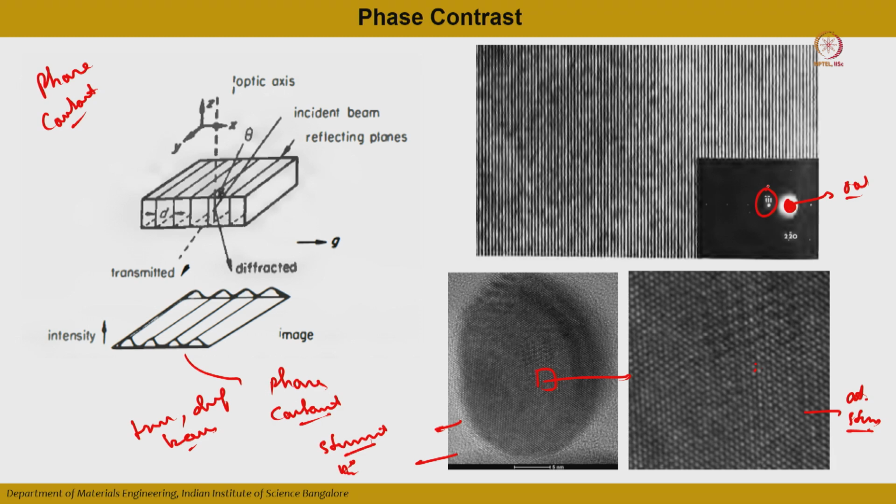correct. Now, if it is in a 2 beam condition, it means you are allowing only one set of particular planes for the diffraction. What it means is, there will be interference of only the central spot and this particular diffracted beam, due to which you will see the intensities corresponding to only the 1 bar 1 1 plane.